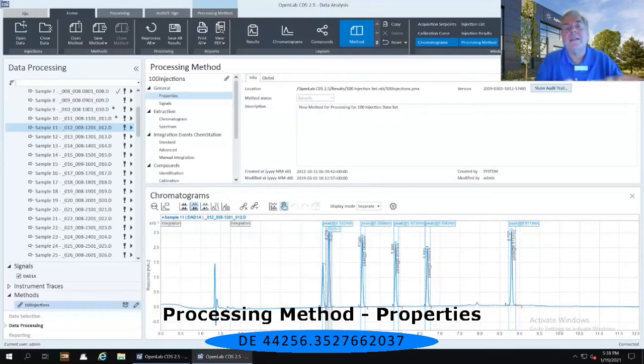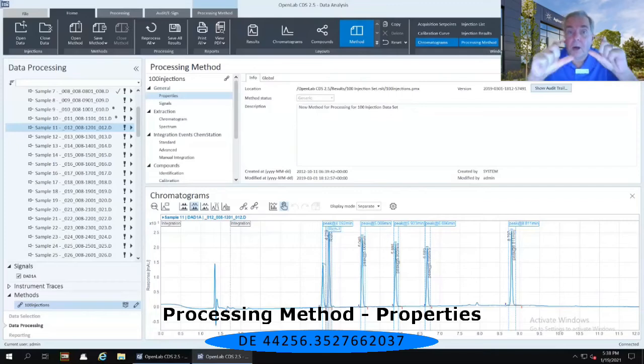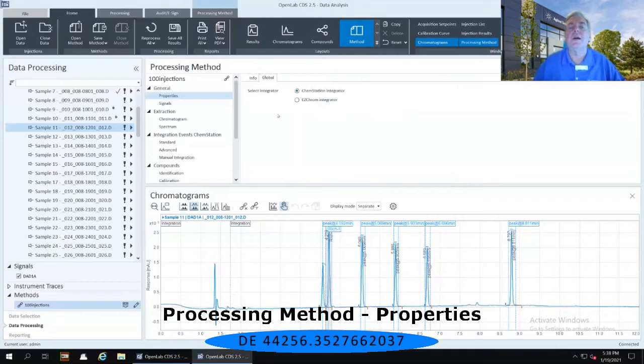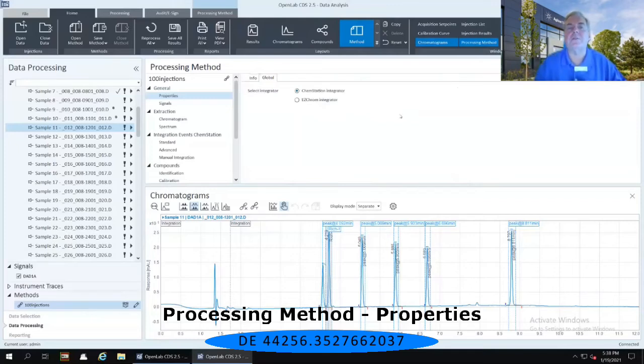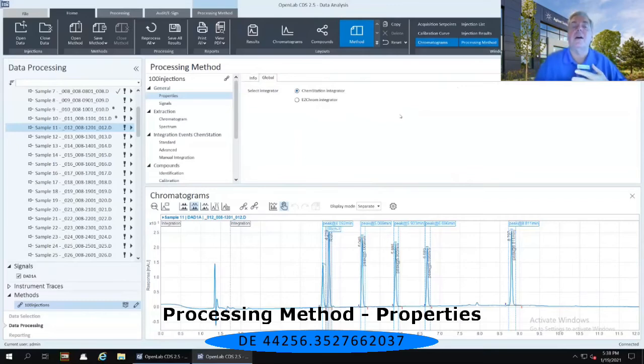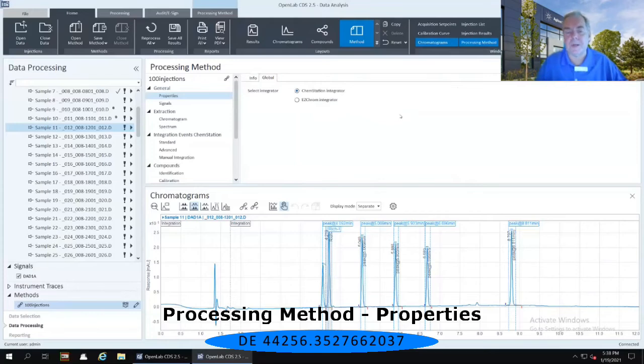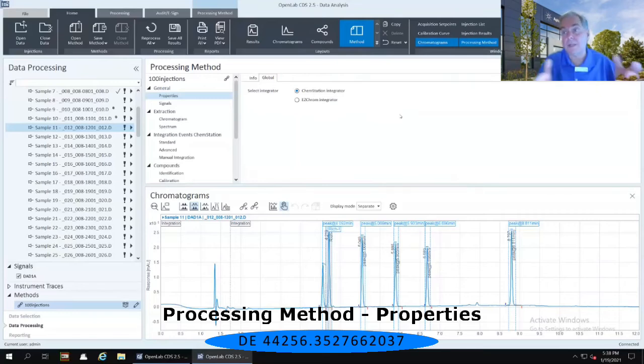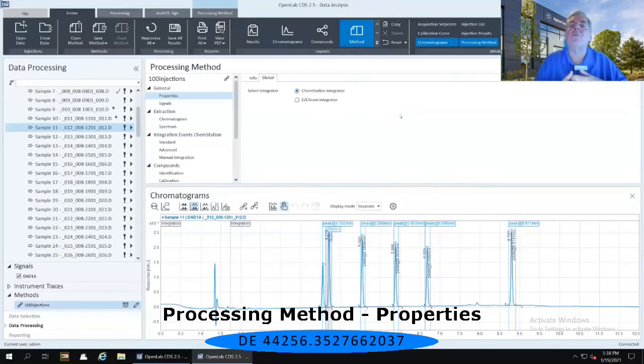Now, immediately to the right of the info tab, there is a global tab. If I select that global tab, it shows you that we have two different integrators associated with OpenLab CDS, both the ChemStation integrator and an EasyChrome integrator. Now, we do this for a very specific reason. Many of you will be coming from some of our older software packages, such as ChemStation and EasyChrome.